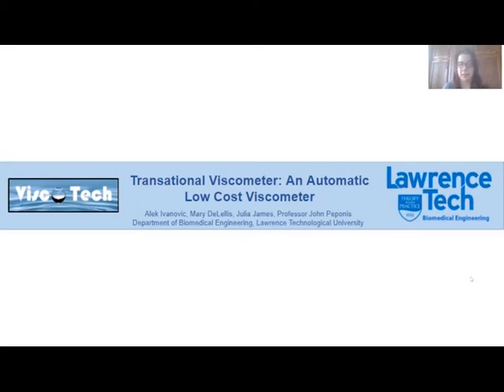Hello, my name is Mary Delellis, and I have been working with Alek Ivanovic and Julia James under Professor John Peponis to develop an automatic low-cost viscometer, which we call ViscoTech.